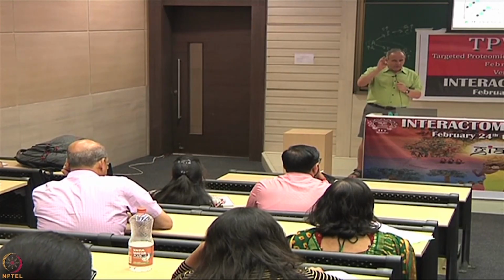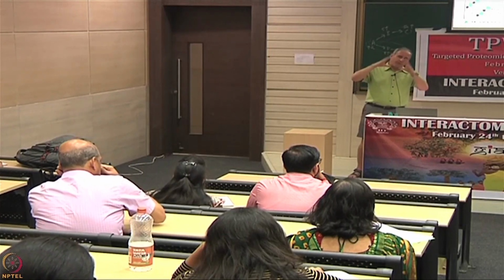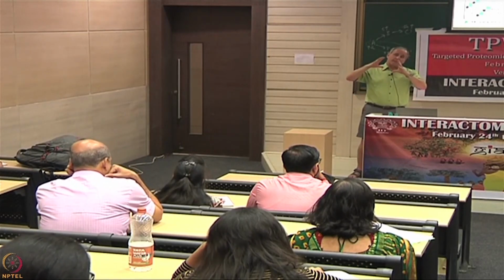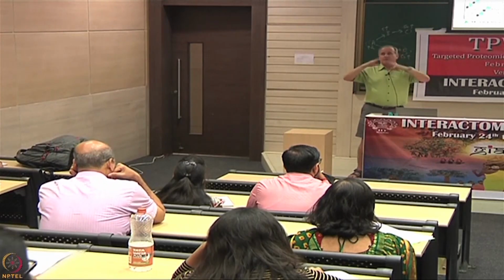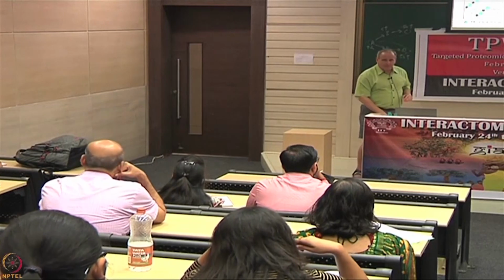So a very narrow spot would be like a 1. Bigger would be 2, 3 would be a pretty good size, 4 would be like spilling into the neighboring spots, and 5 would be, you know, huge. So it's kind of the size and intensity of the ring.